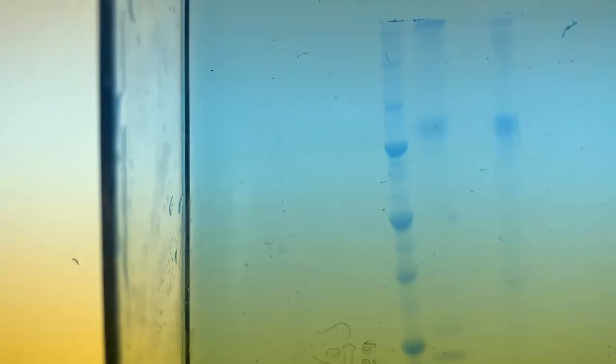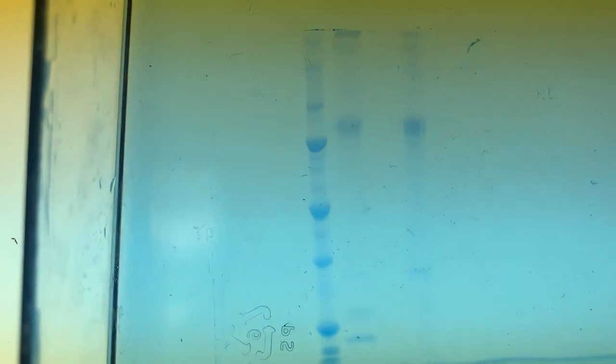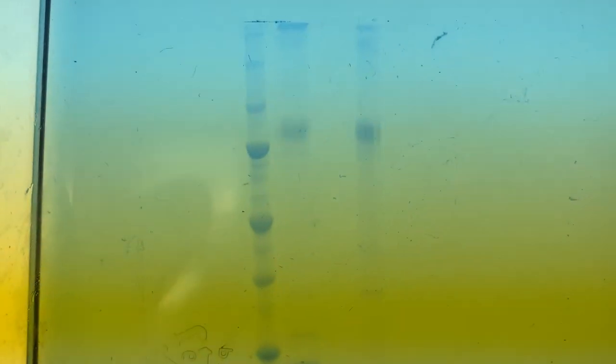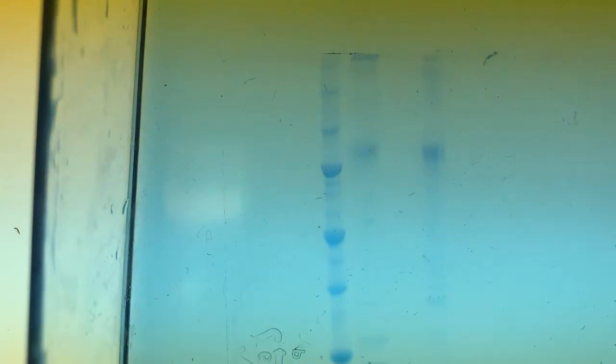Each band represents a single protein or multiple proteins of similar length. The stronger the band, the more of that protein there is — though it's deceptive, because for small proteins the same number of copies gives a weaker signal due to how the dye works. It's a non-specific dye that globs onto certain amino acids, so signal strength can also differ depending on amino acid composition. In general, a stronger band means more of that protein, and more bands means less pure the sample is.